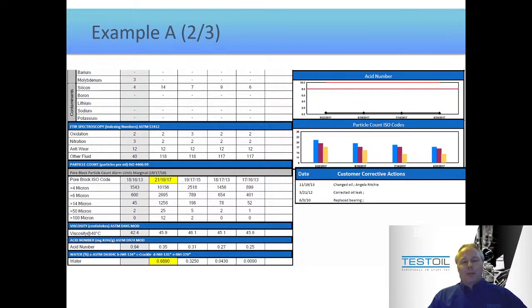So we keep reading the report and we look down at the viscosity. Now remember, I did say it was a 46, and what's the viscosity? That's near perfect. So that confirms to us that yes, at least this is a 46. It did have relatively equal quantities of phosphorus and zinc. It looks like it's an AW oil. So it is an AW46. Like I said, it just probably isn't conical.